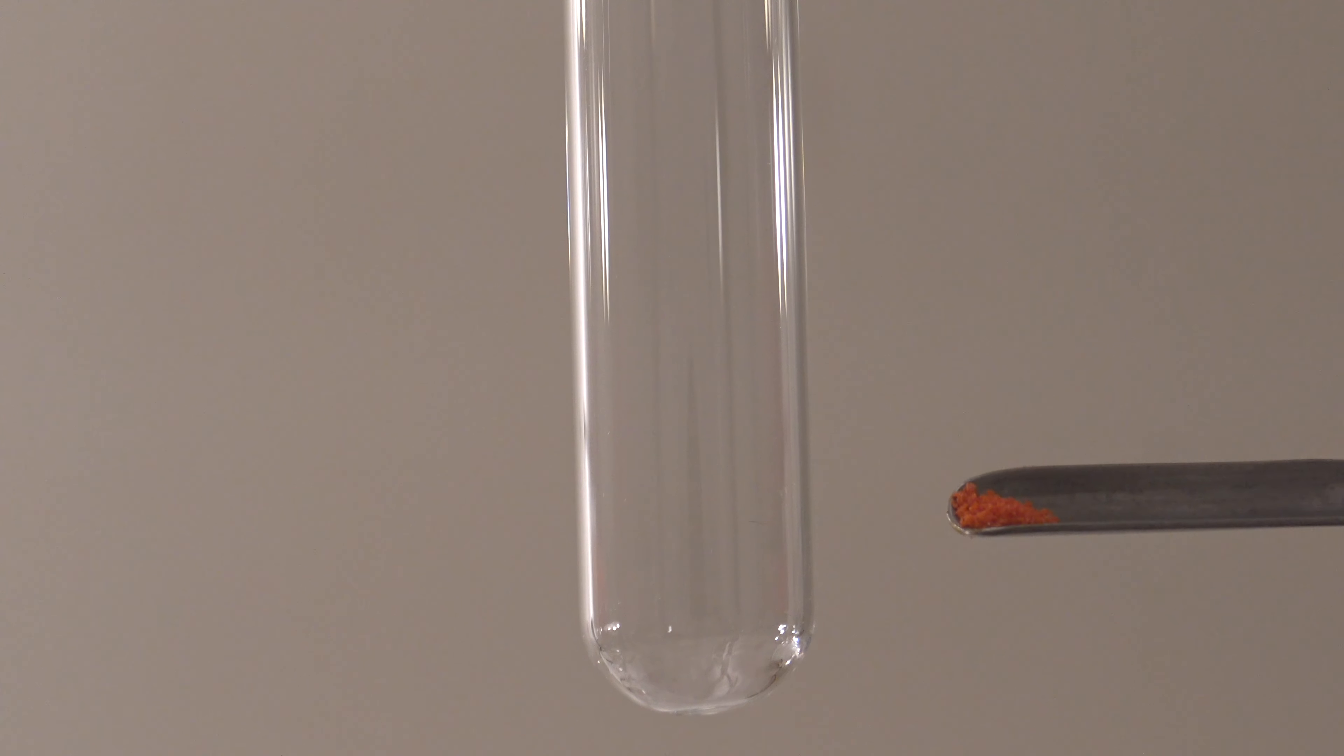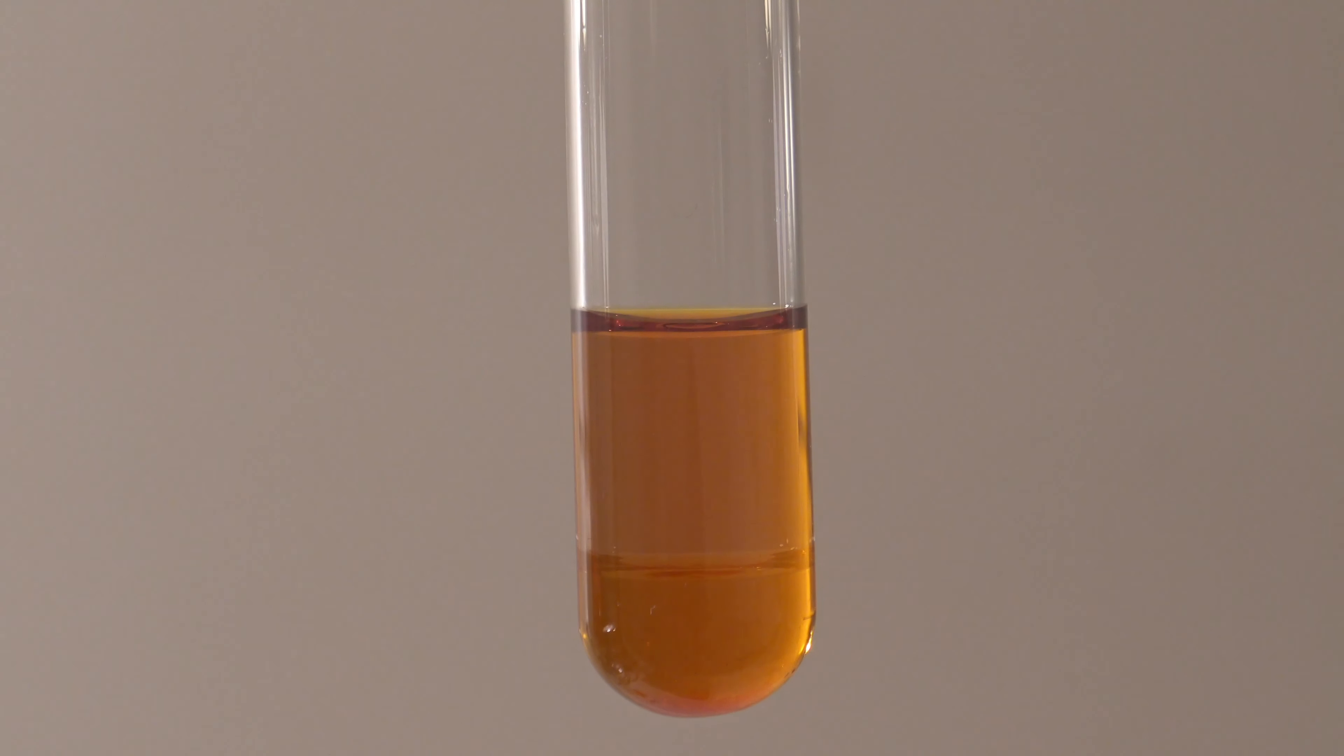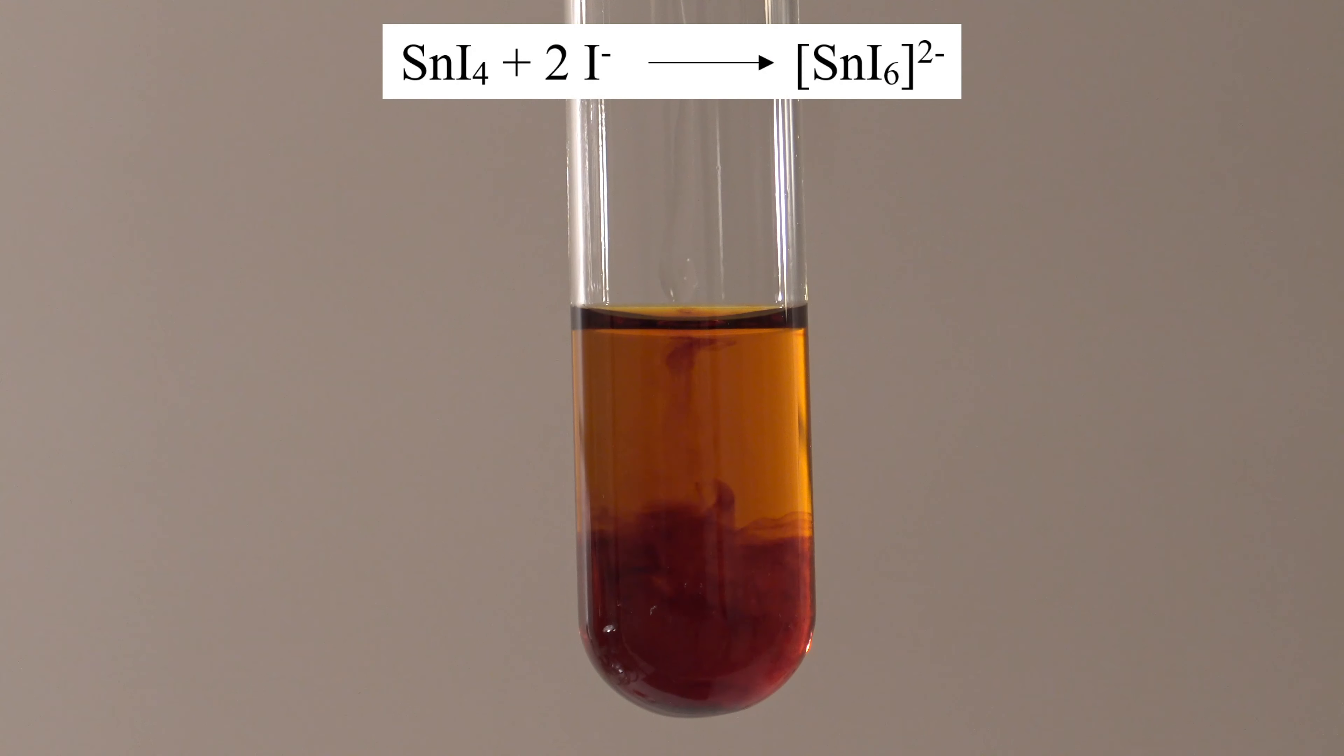Tin(IV) iodide can be used to prepare hexaiodo metal complexes. These are rare because they are unstable. According to some literature, it only has to be dissolved in an organic solvent and a saturated solution of sodium or potassium iodide has to be added. This should cause the formation of the complex hexaiodostannate.